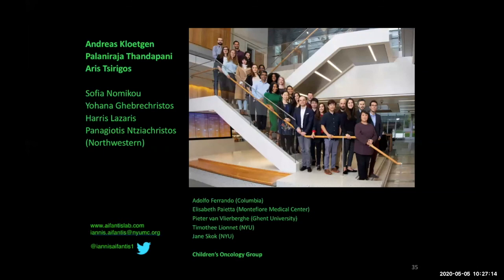So basically, it is a computational way to quantify interactions within the TAD and also quantify and define the insulation and the loss of interactions that happen on boundary areas. Take a look at our methods and maybe even Andreas can help with that.